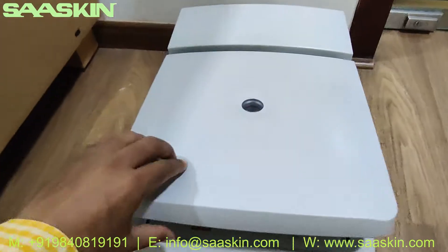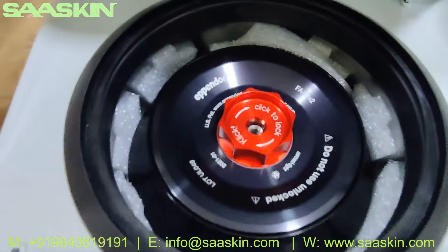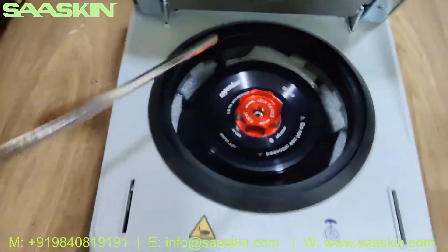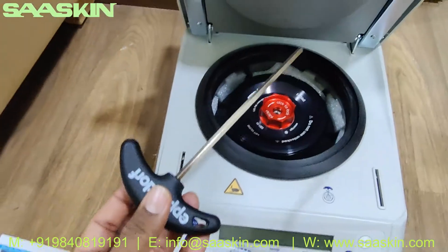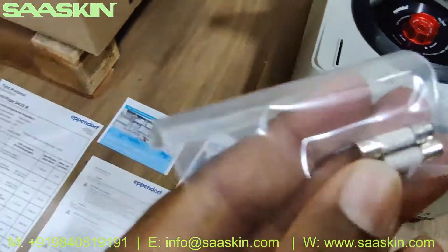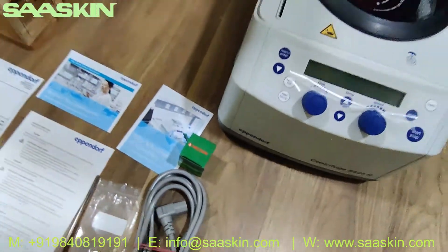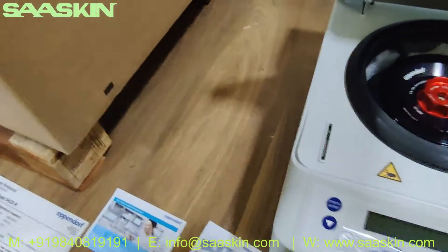Let me open this machine. You can see the rotor inside. This key given along with the unit is used for unlocking and fixing the rotors — that's the tool additionally provided. Also included are two fuse pieces. This is how all the machine contents look.